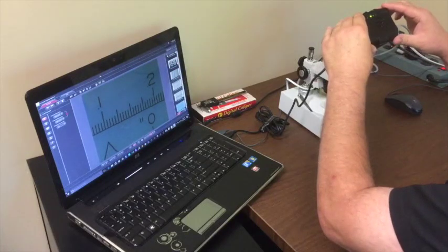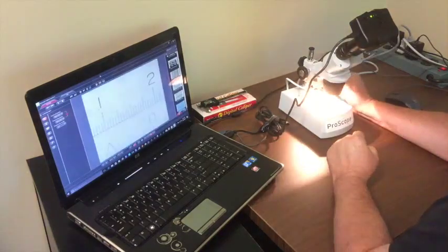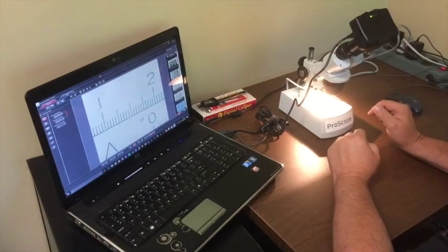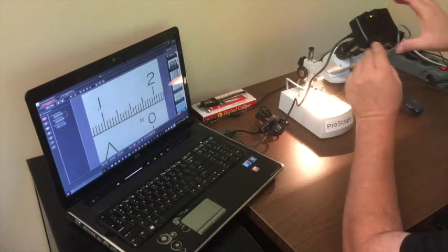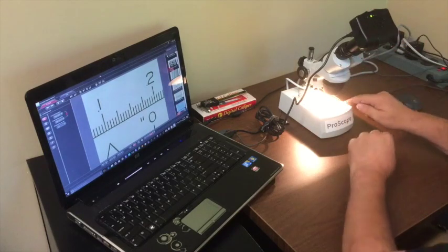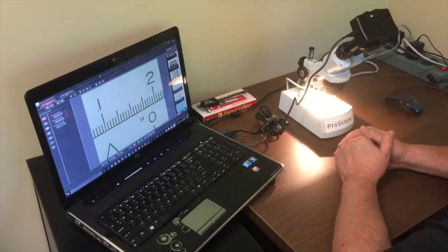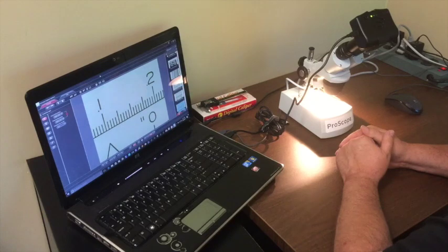The first thing I want to do is turn on the light of the microscope and let the camera adjust. I'm going to square up the subject, which is a little glass round reticle that I'm going to use to calibrate measurement. Once calibration is done, anything that is in focus will be in calibration. We'll go through those calibration steps and then confirm that our calibration is correct.